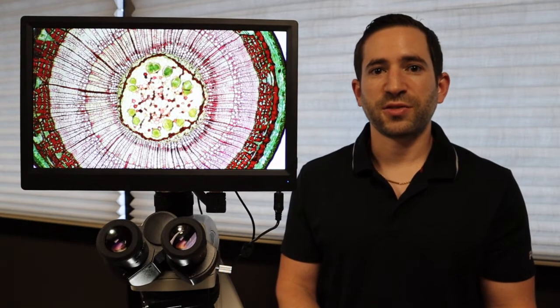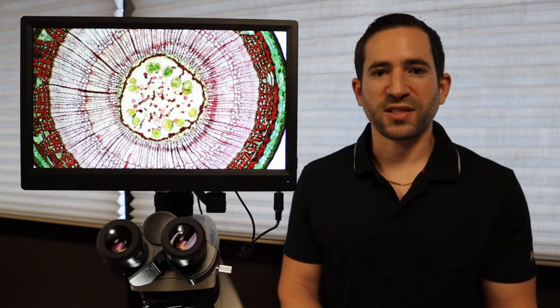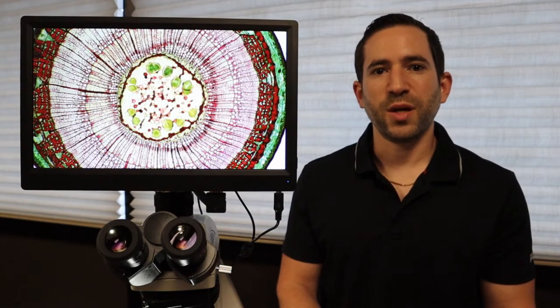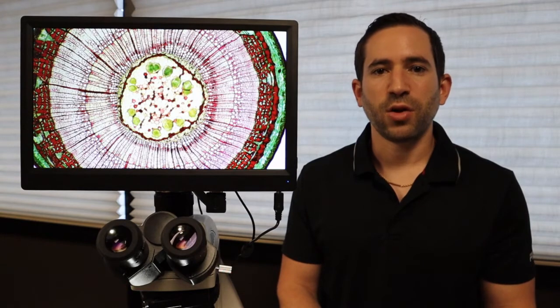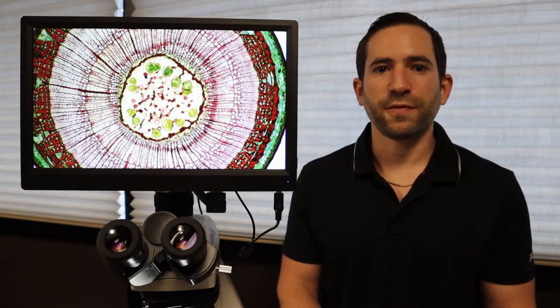A microscope with an LCD screen provides an all-in-one streamlined solution for digital microscopy. It provides a live image right above your eyepieces which can be useful for training, teaching, or just giving your eyes a relief from staring through your microscope eyepieces.